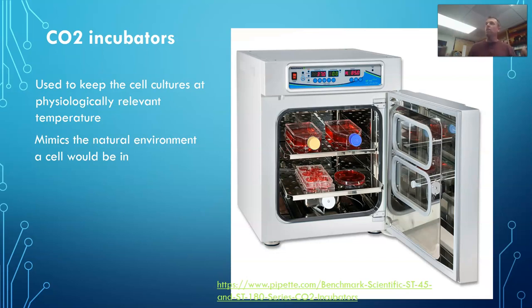If the chamber of their spaceship got up to 6% CO2, they were going to die, because that reverses the diffusion. If your cells are at 5% CO2, that CO2 is higher than the CO2 in your blood, so it diffuses to the blood. In the blood, it's higher than the lungs, and in the lungs, it's higher than the outside air. But if the outside air becomes 6%, you're actually no longer able to get rid of your CO2. If anything, the diffusion is coming from the air on into your cells. And that's why they would have died if the chamber made it up between 5 and 6% CO2.